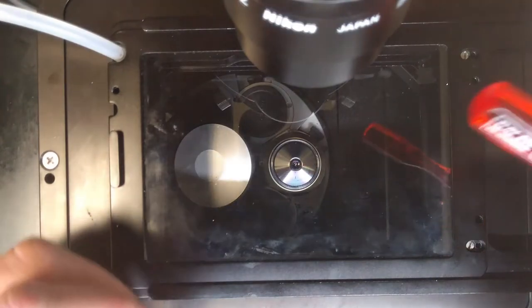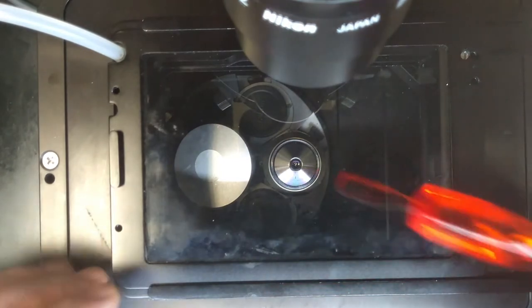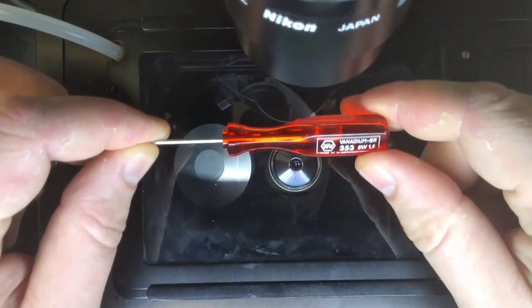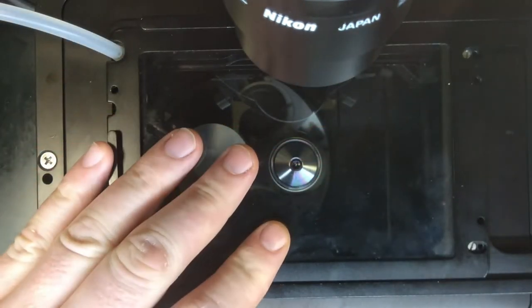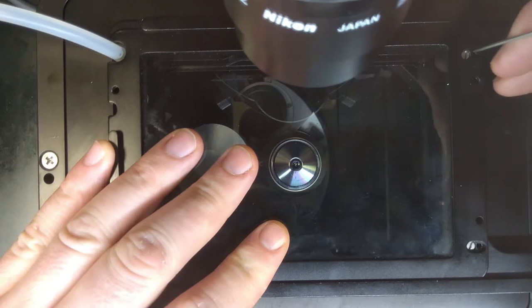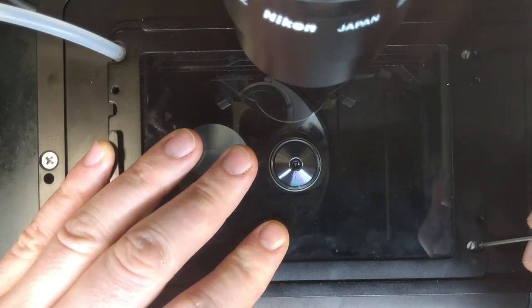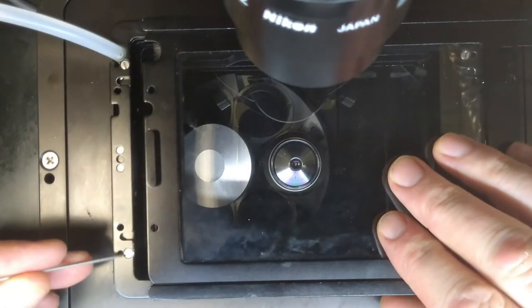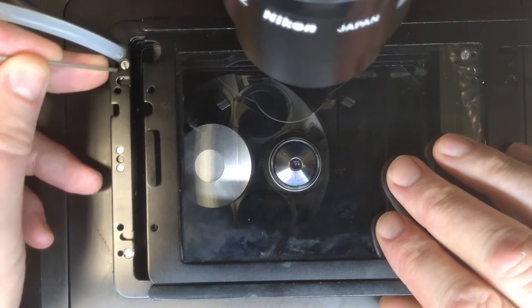In order to remove the OcoLab stage, you must first make sure you have a 1.5mm hex screwdriver. Then you must locate the appropriate holes next to the flat-headed silver screwed tops. These are the only holes that you should put this hex driver into.